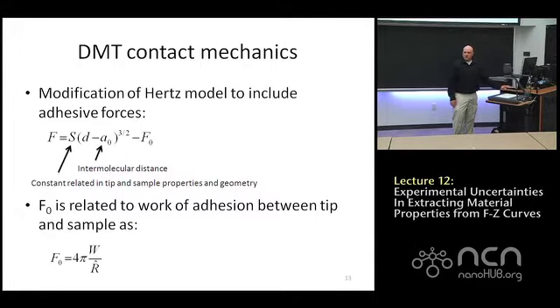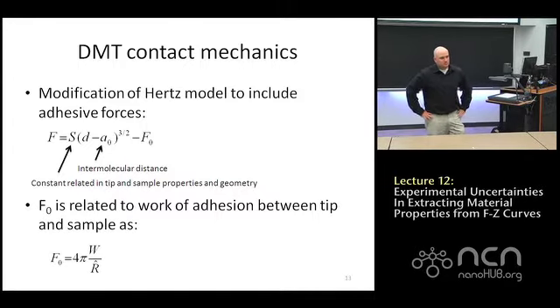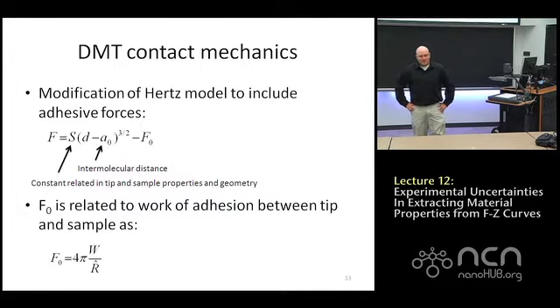Any other questions on this? So you're measuring the mechanical properties using a model. It's not like a typical test where I take the slope of the curve and find the Young's modulus. You're using a mathematical model to get the material property. It will depend on the model. Right, but I will point out that saying your slope is linear in a stress-strain curve is also a model. It's just a much, much simpler model.